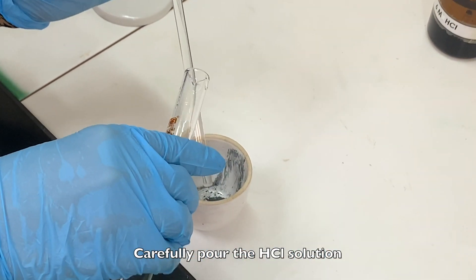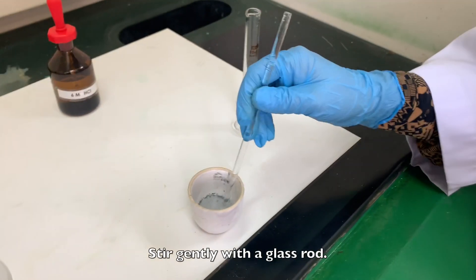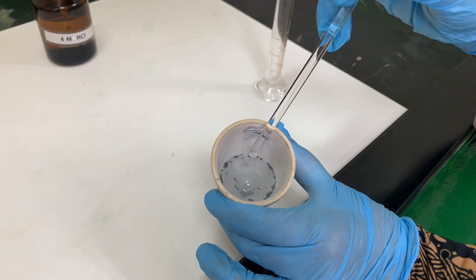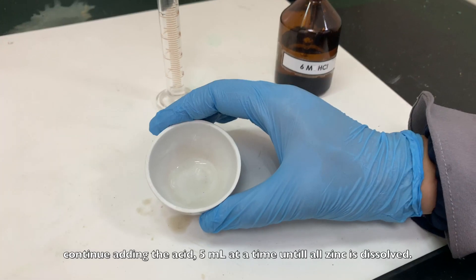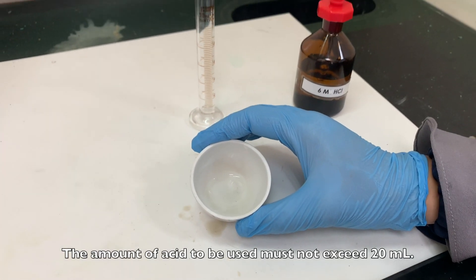Carefully pour the HCl solution into the crucible containing the zinc powder. Stir gently with the glass rod. If the zinc powder does not dissolve completely, continue adding the acid 5ml at a time until all the zinc is dissolved. The amount of acid used must not exceed 20ml.